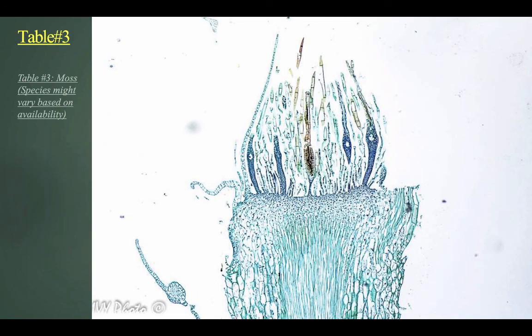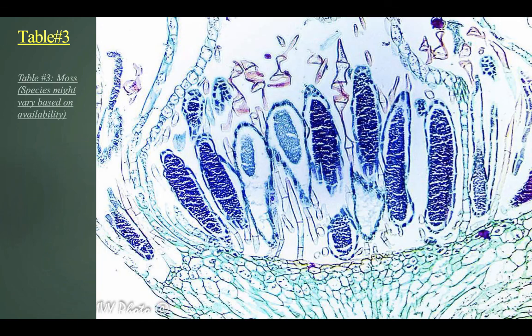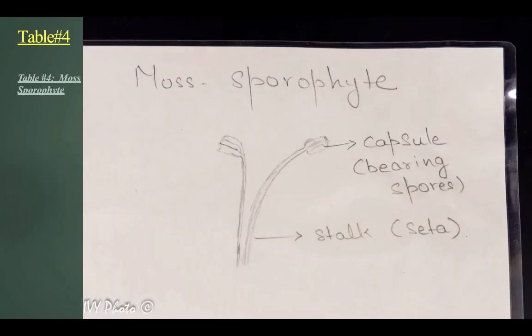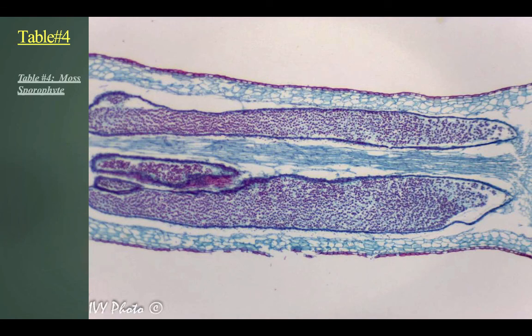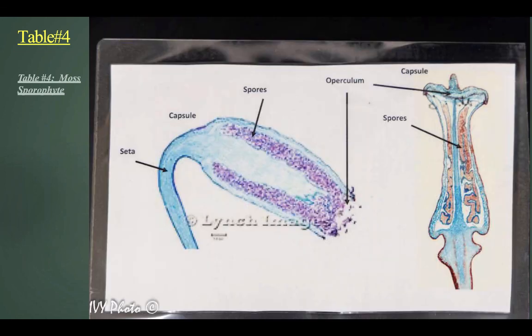And then they're going to have you essentially start observing underneath the microscope, the dissecting, the stalk, the capsules, the seta, the operculum, all of those. So you're going to look at these and get an idea of everything that you need in here. There's really nice, right? You can see the spores in the capsule really nice there. And they're looking, this is what I was referencing here.